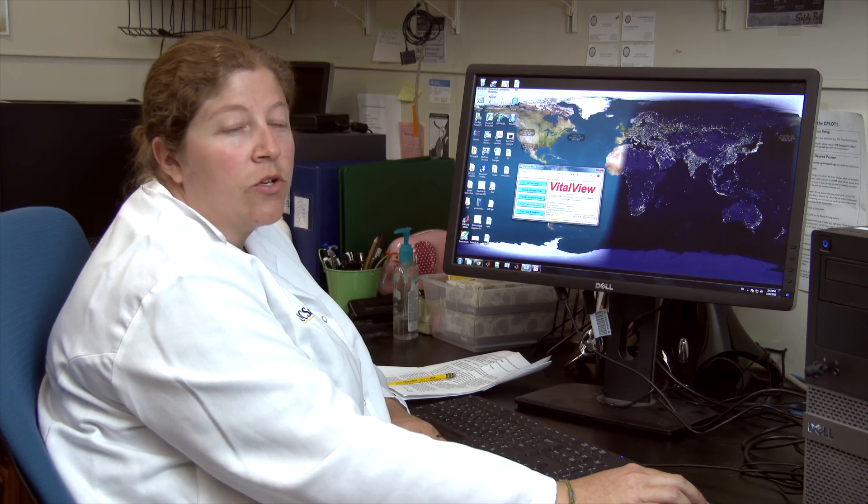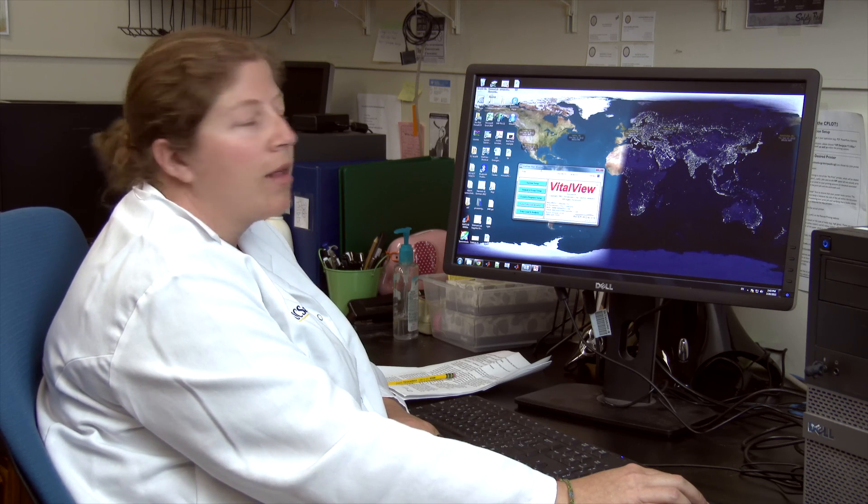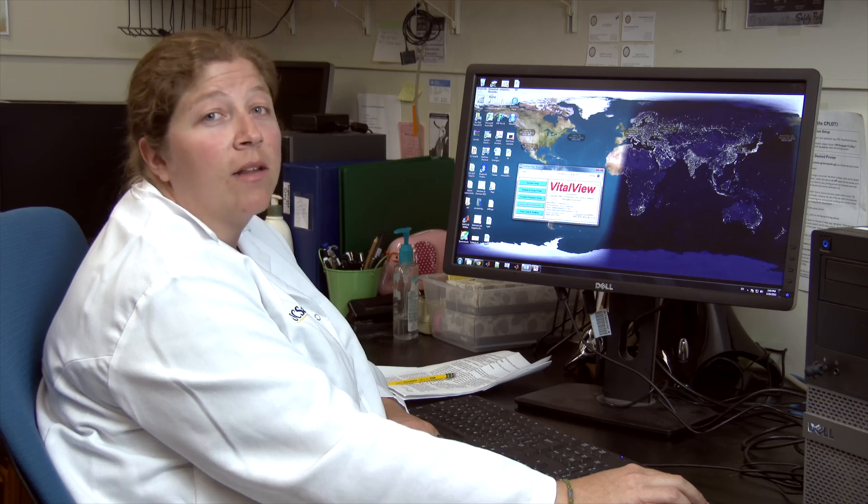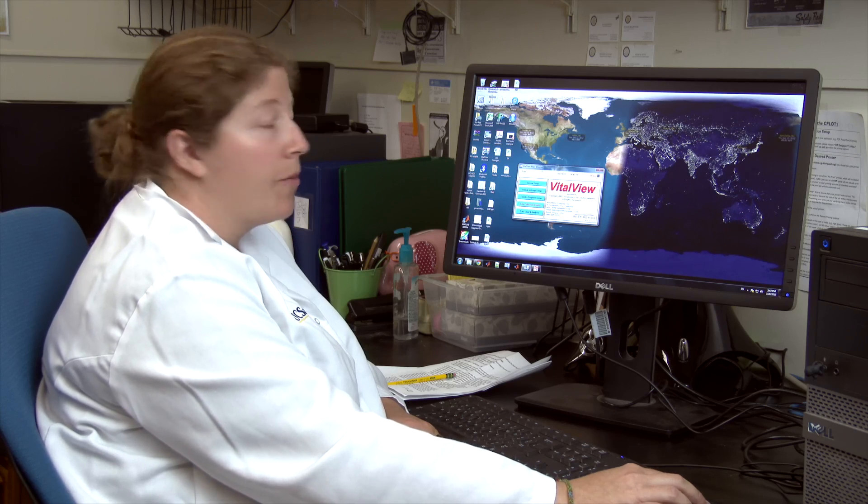Now I'm going to exit out of VitalView because VitalView is the software we use to collect the data, and I'm going to open ClockLab because ClockLab is the software we use to analyze the circadian rhythms of the animal.